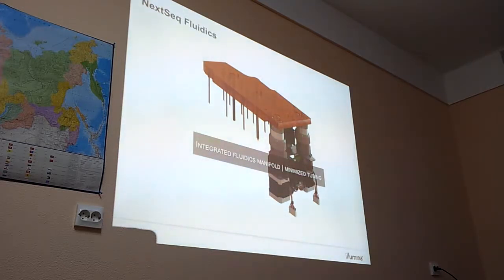The famous valve in the old version in the MiSeq was initially a problem, but now we have resolved it. Now we have a good valve, and in the NextSeq we also used good valves. And we have two of them.